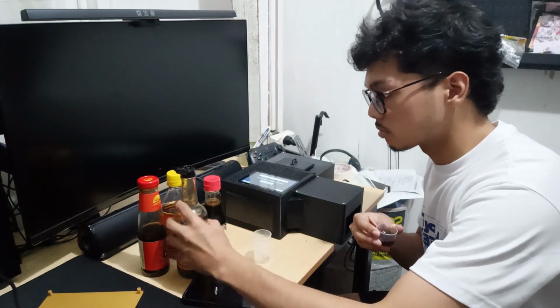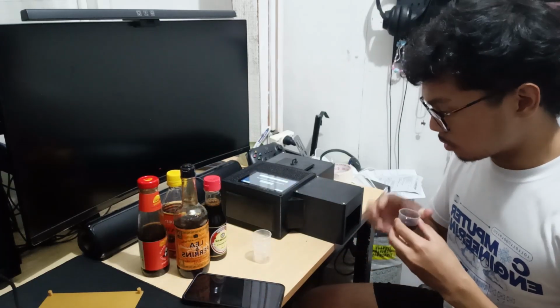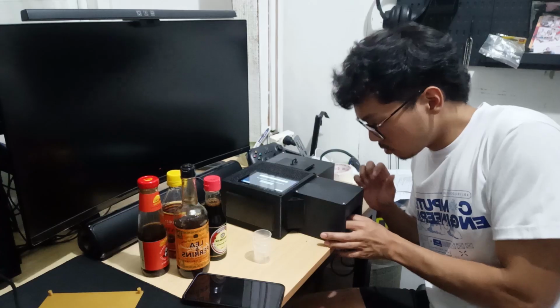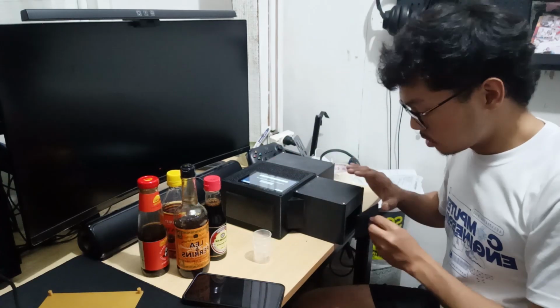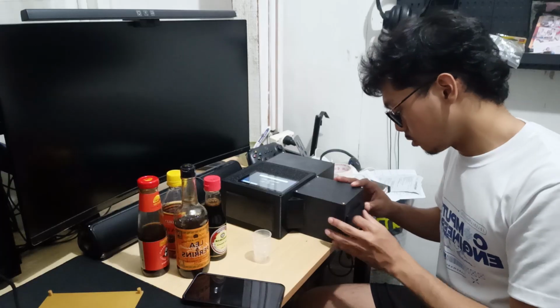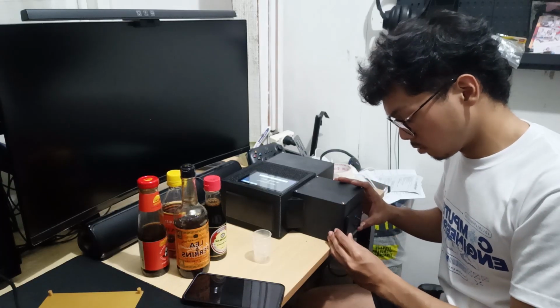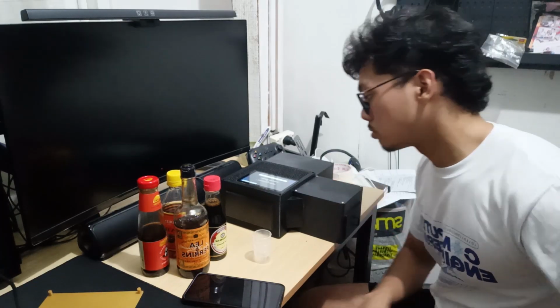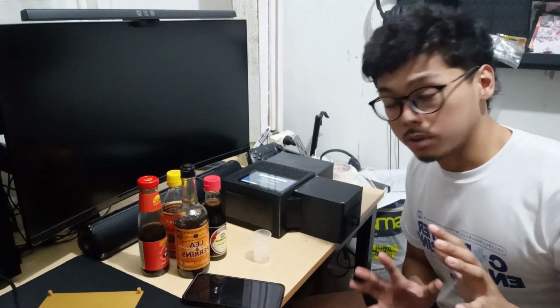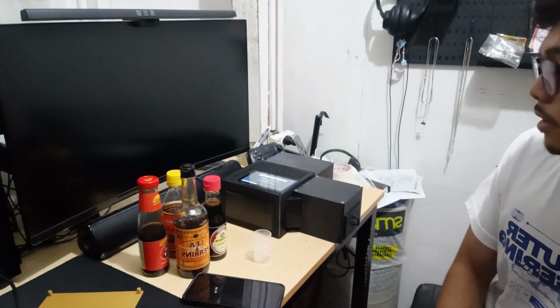Okay. So I'm going to place here. Then close. Then start. So let's wait 10 minutes and I'm going to pause. I'll see you guys in a bit.